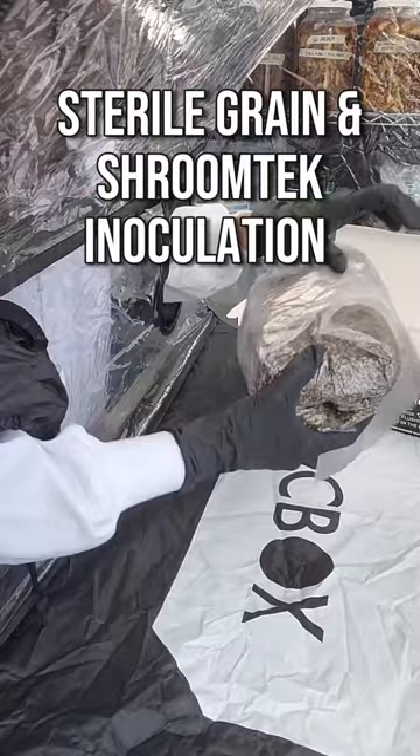And when you're done, it's easy to clean, transport, and store. For more information on the knockbox and how to avoid contamination in mushroom cultivation, visit us at northspore.com.